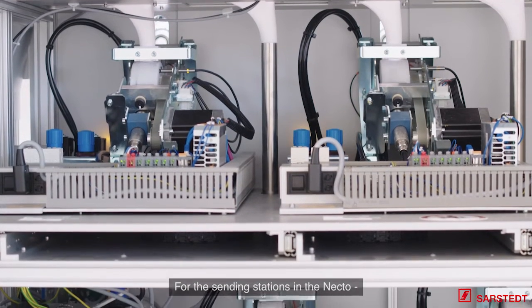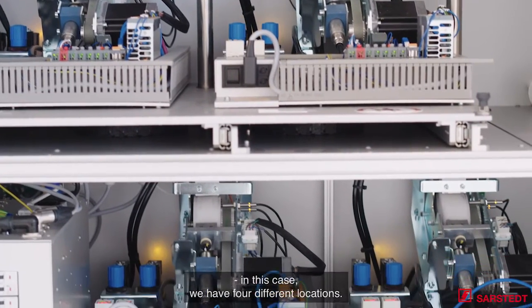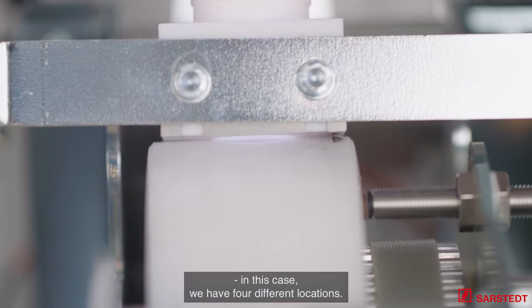The sending stations in the Necto — in this case, we have four different locations.